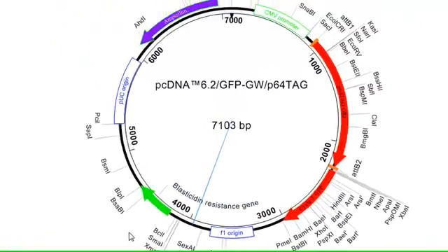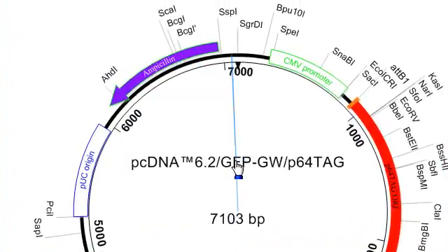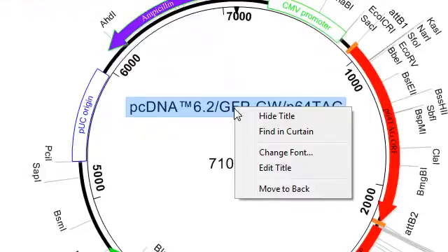So, as you're working on editing your own map, if there's something that you want to change and you're not sure how to do it, a good place to always start is to select the item that you want to change, and then right-click on it, or control-click on Mac, and you'll be able to see all of the editing options available for that item.